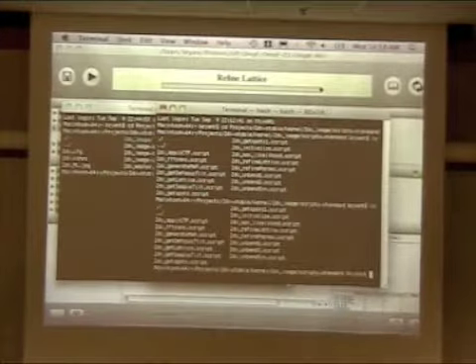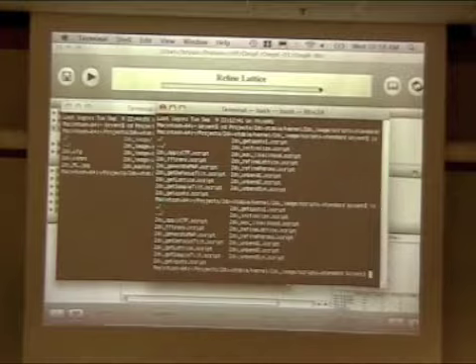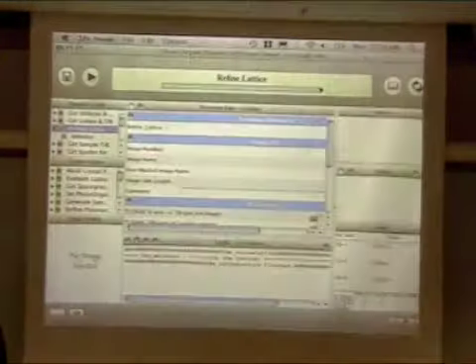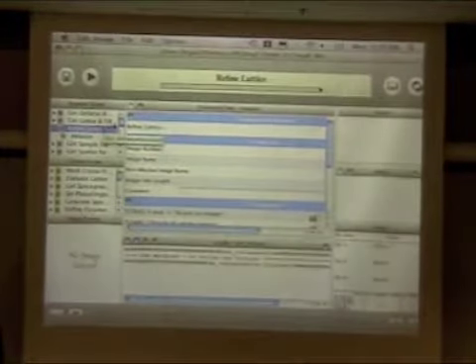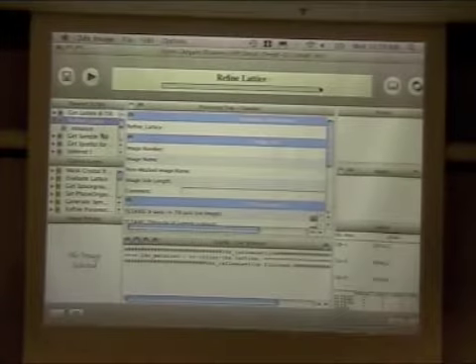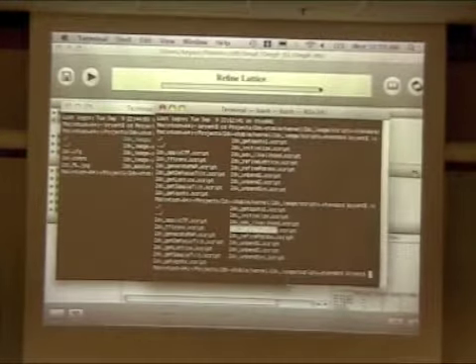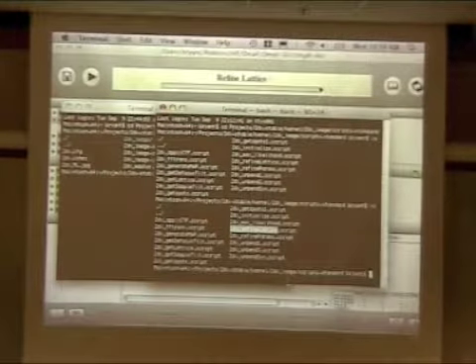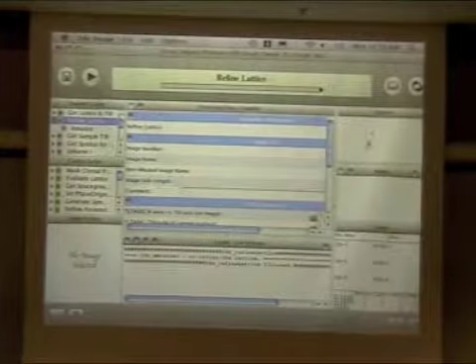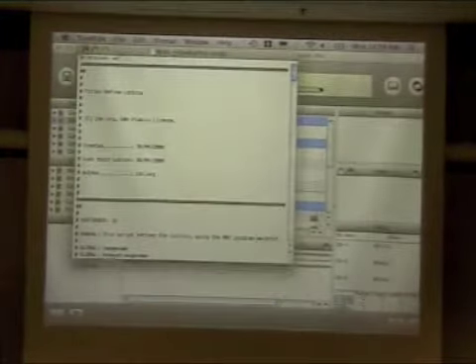So if we just go ahead and look at those, everything you see in this directory, 2DX apply ctf.script, etc., is used in generating everything that you see here. It just automatically opens that folder, goes through, adds all of these scripts individually. So let's see if we can find refine lattice right here. So that was just drawn right out of there. And then it was used in all the parameters that you see, really all the images, if you were to see any here, or results that are generated, all come from this script. So let's go ahead and have a look at that.